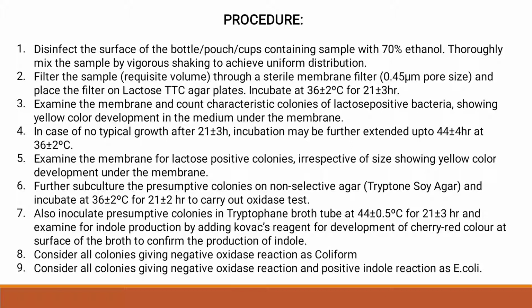Then we have to examine the membrane and count the characteristic colonies of lactose positive bacteria showing yellow color development in the medium under the membrane. If yellow color is developed, then it is an indication that coliform bacteria are present. In case of no typical growth after 21 hours, we have to extend the time period up to 44 hours at 36 degrees centigrade.